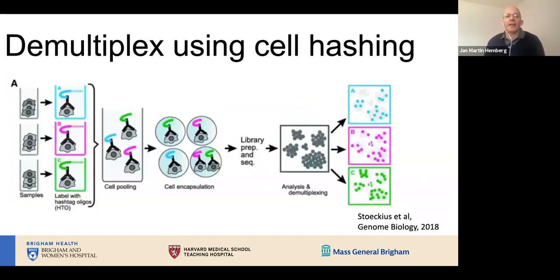The other thing that this has been built on is to develop this method called cell hashing. And the idea here is that you can use this for doing demultiplexing. So you can basically add these antibodies with specific tags to each of your samples. You add the antibodies with the specific tags, and then you can do the demultiplexing later on. So that again will allow you to overcome batch effects, and possibly also save some money when you're doing your experiment.